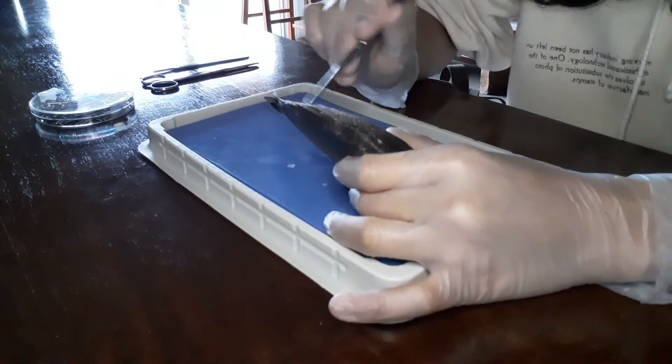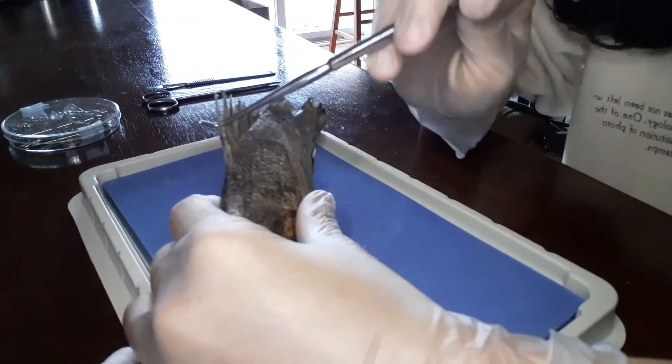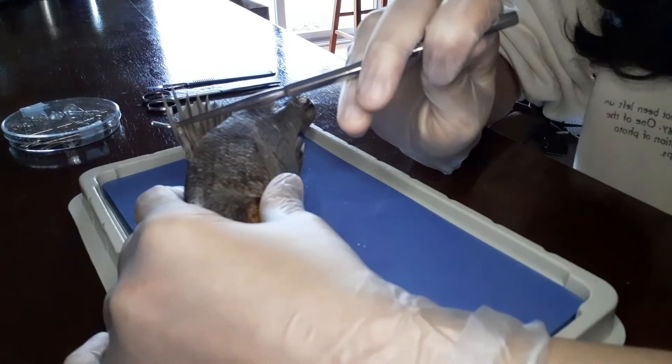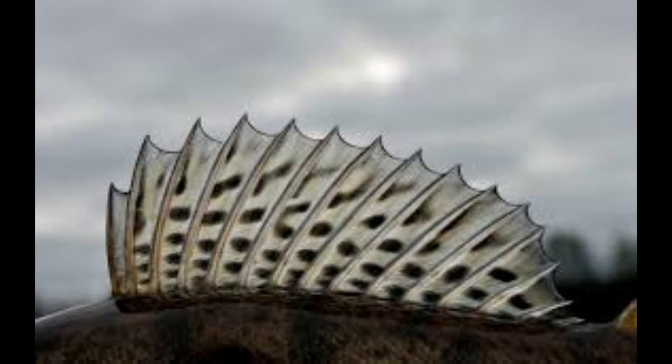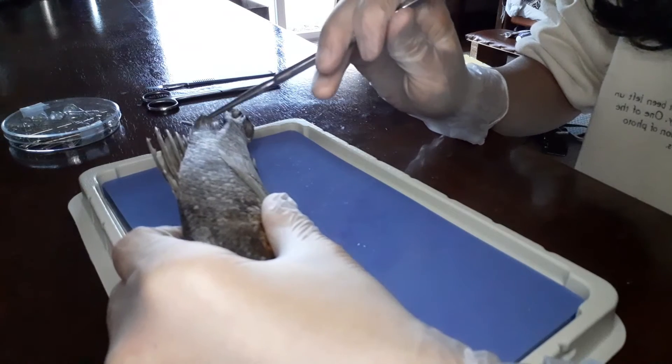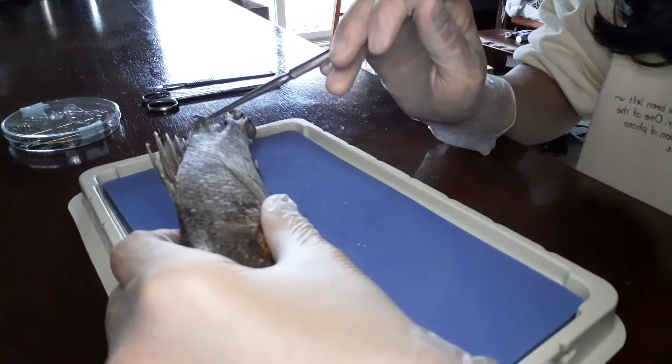Here is the dorsal fin. Here is the spiny dorsal fin — it helps with defense. Here's an example of a spiny dorsal fin. And here is the soft dorsal fin, which helps with quick movement around sharp turns.